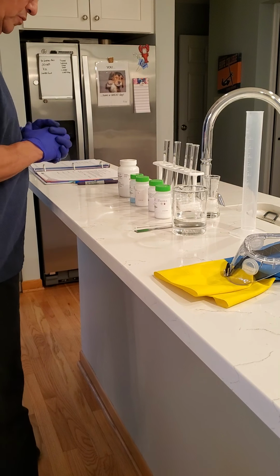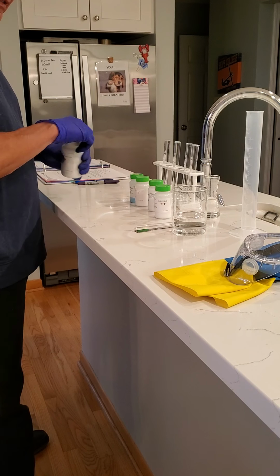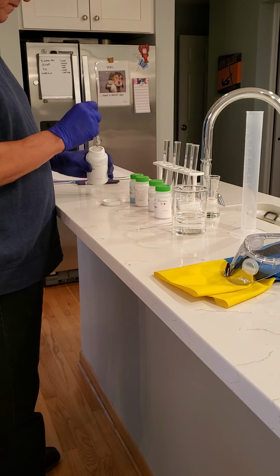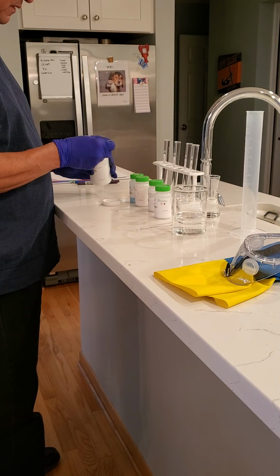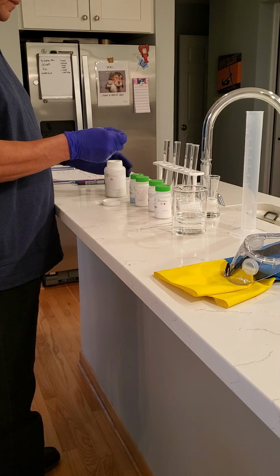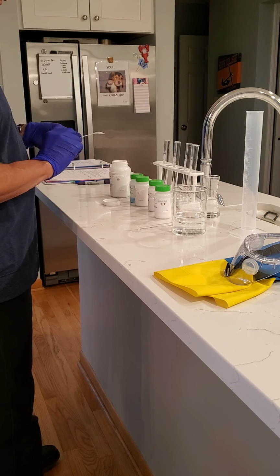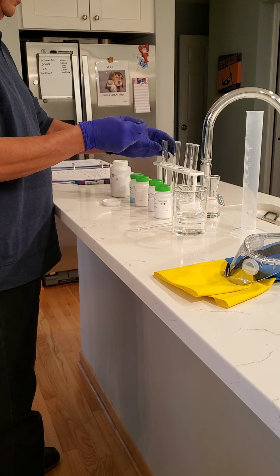The first one that we're going to test is our calcium hydroxide, and it says use half of a spoonful. This is very powdery, so we'll take half of a spoonful of the calcium hydroxide, and we'll add it to the first test tube.